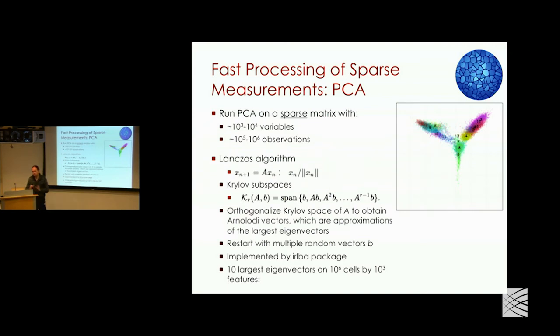So that's sort of... Those are cells. Some cells. Some cells, it's in the genes. So that tells you about sparsity a little bit. Right. That's true. So it's more like 10% to 50%. Yeah, something like that. It depends on the data set again. Sorry, of non-zeros. So I'll show you some data that will be much sparser than this.